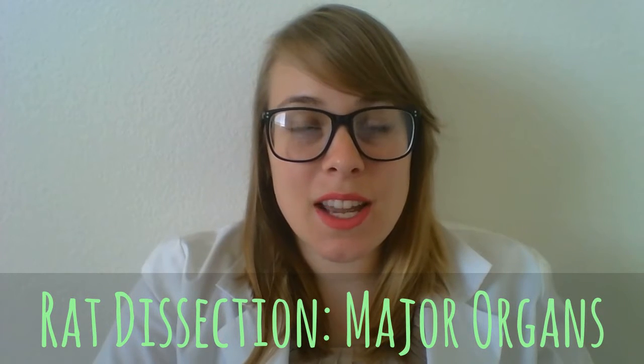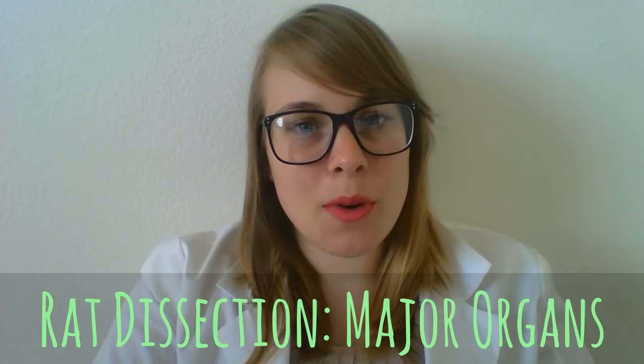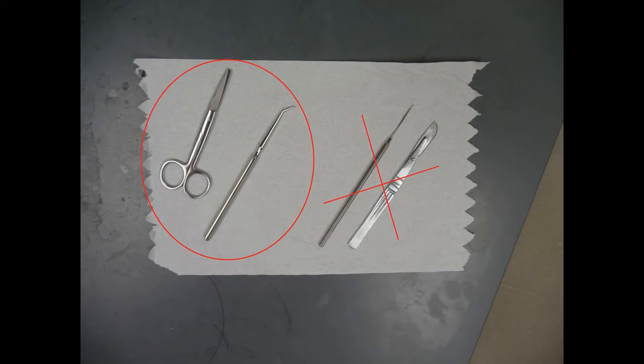Hi everyone! Today we're going to be going over the major organs of our rat dissection. Now remember, we're only using a blunt probe and scissors, and not a scalpel or any of the picks. Also remember, we're starting with our rat dorsal side down and ventral side facing up.